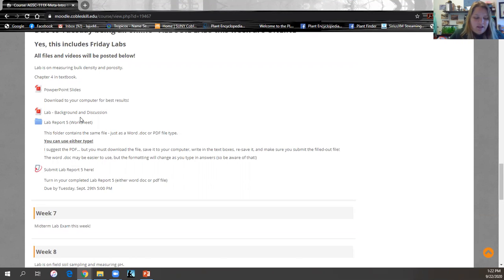So it's a mixture of looking at the bulk density of a soil that could be compacted, so we can really pack it into the crucible, or a soil that's been wet up, that's allowed to aggregate a little bit, has a little bit more pore spaces in it, so a little bit more of what you naturally find happening outside, and then comparing the two, as well as compacting them.